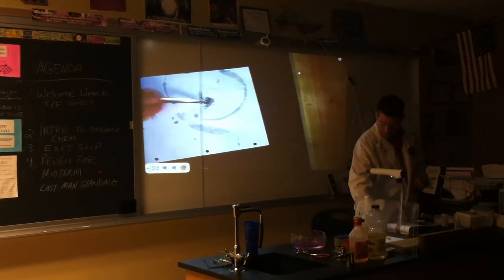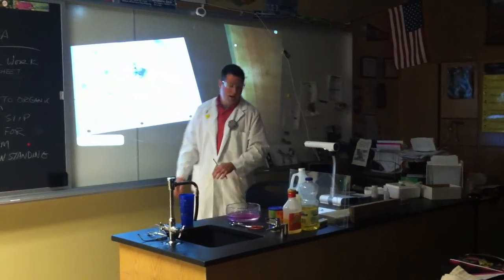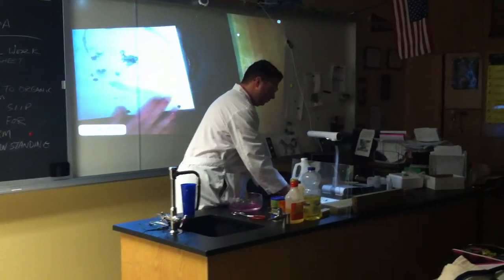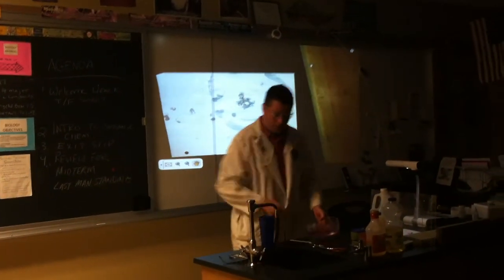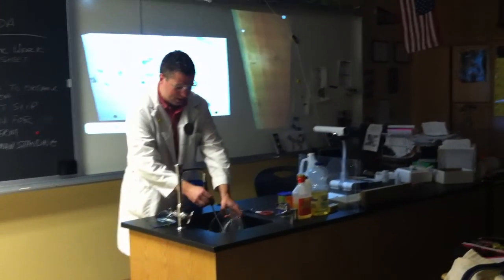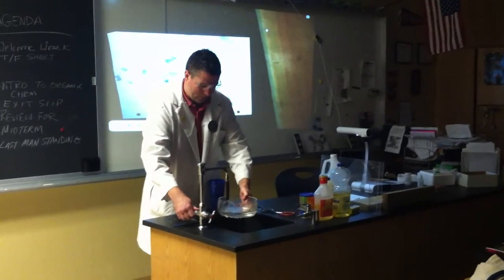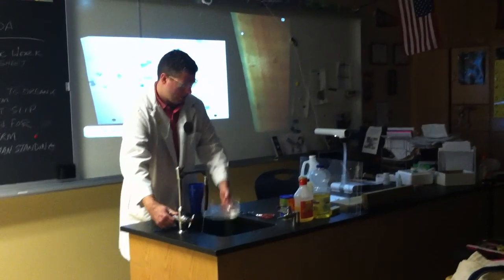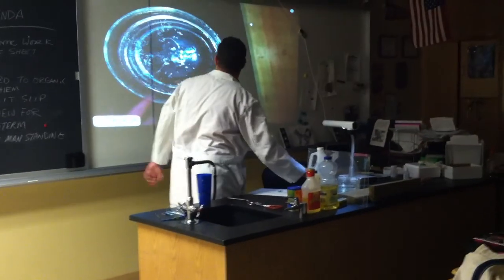So again, this is very, very reactive. It has to be under oil so it doesn't react with the atmosphere's water, the moisture in the water. So we're going to see a little bit more of a reaction. I'm going to dump this down the drain again. Again, you'd see with the indicator a change of color, but I'm not going to put it in there because you've already seen that a couple of times. There's a video on YouTube. Dude drops an eraser size piece in the bathtub and it explodes.